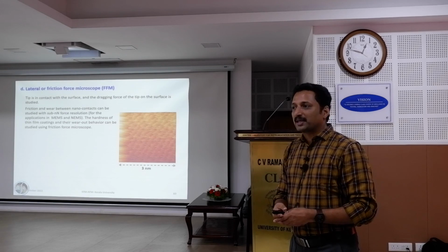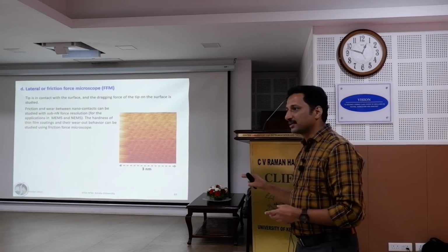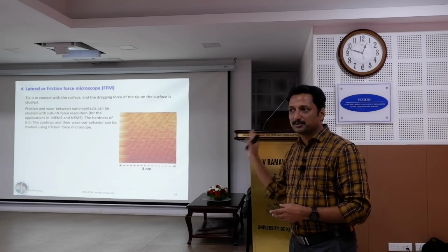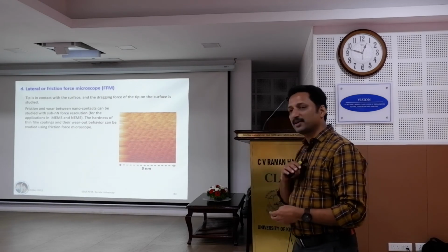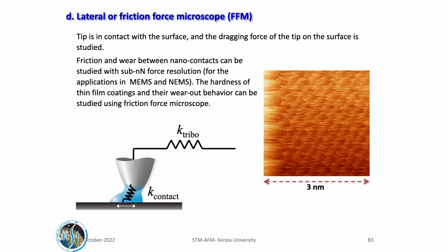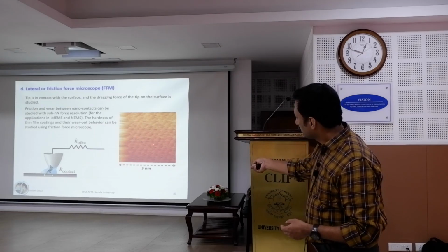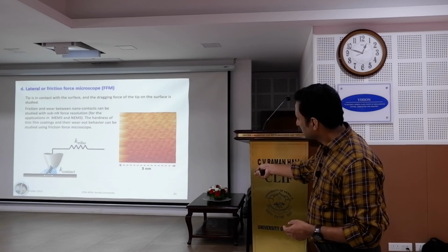Yeah, so in biology, these interactions are very, very important. So in the biophysics field, AFM is kind of a must. It can give a lot of information in biophysics and biology-related fields. So this is what I was doing. What you are seeing is again a graphite surface. All these small noisy bumps you are seeing are atoms of carbon.